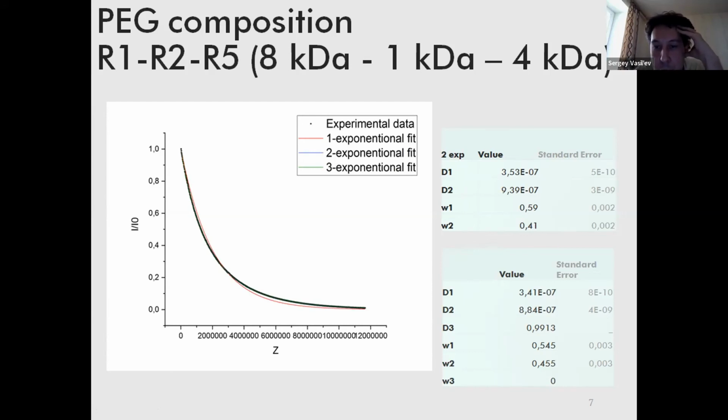So it's not a problem of the experiment or the data and the number of points, it's just a problem of your exponential approximation. And you also should take into account that the points which are less in intensity give less contribution to the fit. So actually the later part of the diffusion decay does not contribute at all to your fitting.